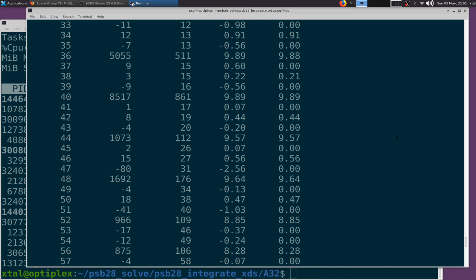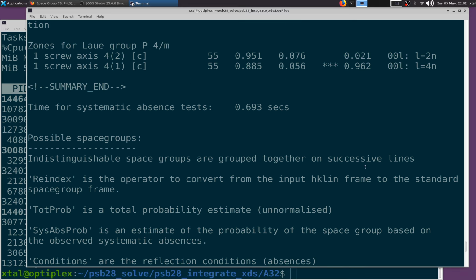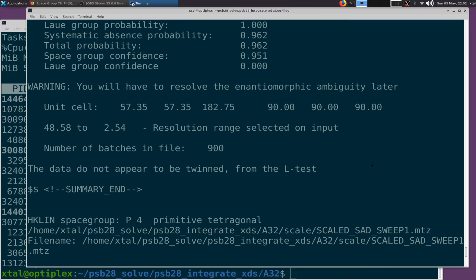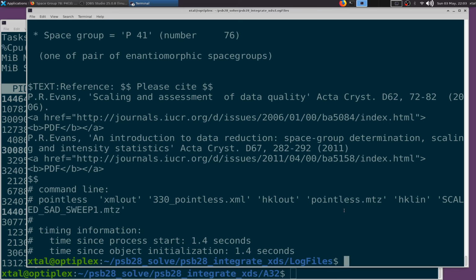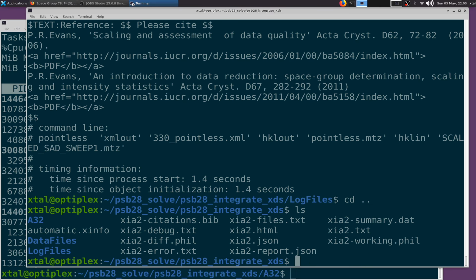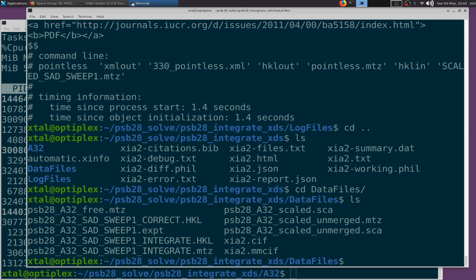So this pattern, which I can see repeating and which I could plot if I were looking on the GUI, strongly implies a 4-fold screw axis, but we don't know if it's P41 or P43. So when we go into CCP4, I will create another version of the file that is re-indexed in the header to have the new space group.